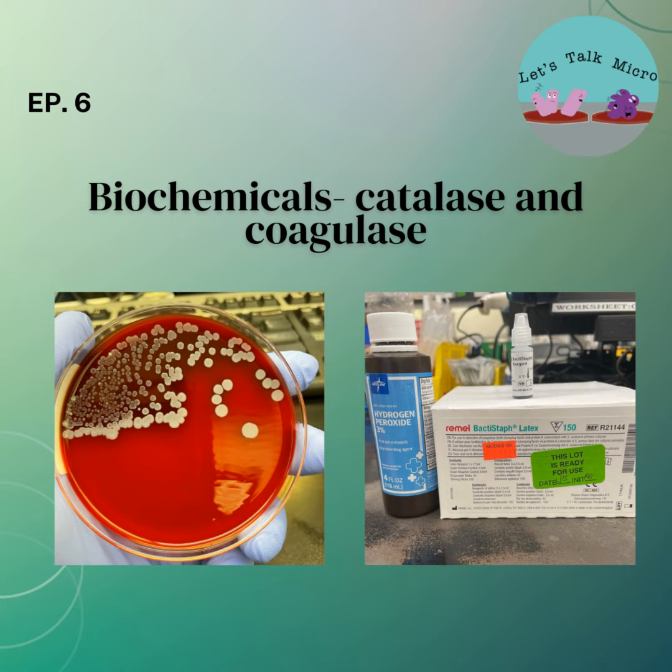Now, in your textbooks, and possibly in some smaller labs in the U.S. and some labs outside of the U.S., they use the tube coagulase. I did that years ago when I was in school. So if you actually perform that, feel free to leave some comments, either on my Instagram page or Twitter, and tell me about the tube coagulase. Please share with the rest of the audience.